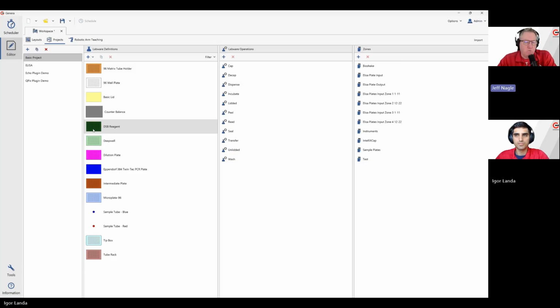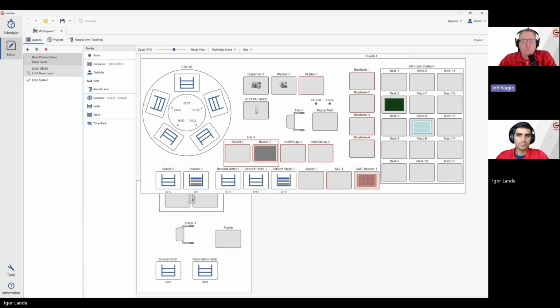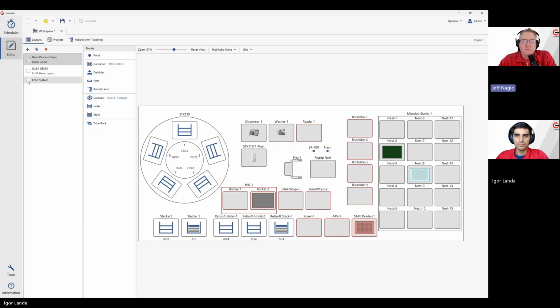He couldn't select individual ones, but he can now remove the ones that he doesn't need, those types of things, or utilize the ones that he does. So it all comes in for it. He can change the labware operations. It's fully editable again now at this point, but at least it gets you a really good baseline to start to work on it. Now you will notice that some of the instruments are not connected to those workspace locations or the nodes there, but that's okay.